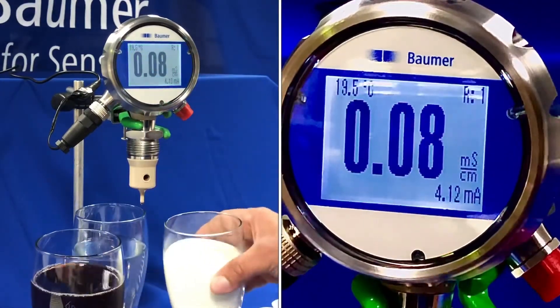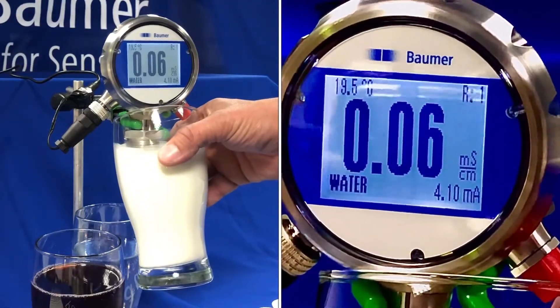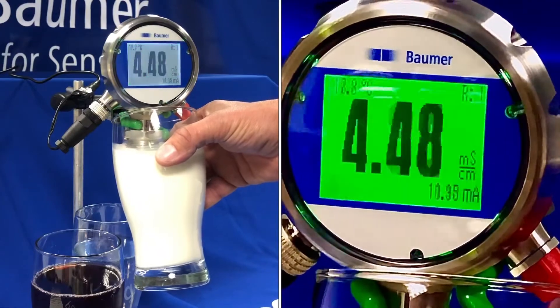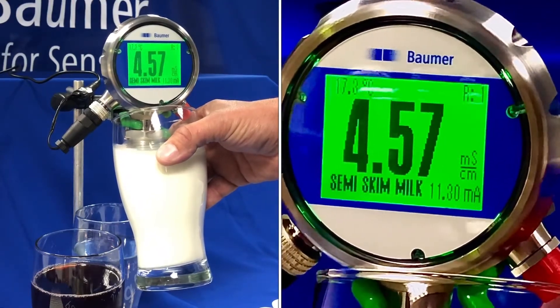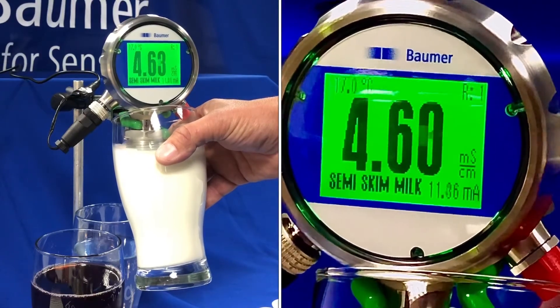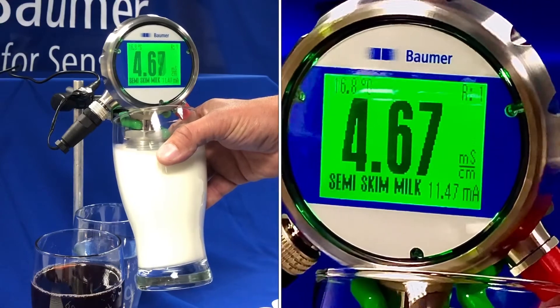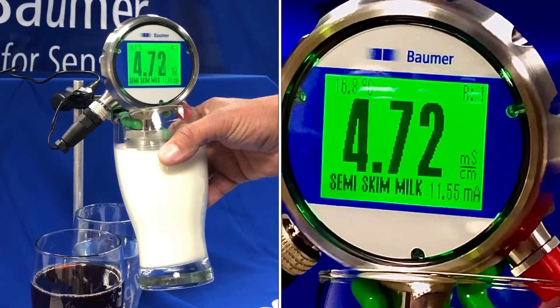Finally, if we look at milk, the reading will change again. We've now got semi-skimmed milk, a steady green display, and about 11.4 milliamps. You can also see the temperature in the top left-hand corner has changed.